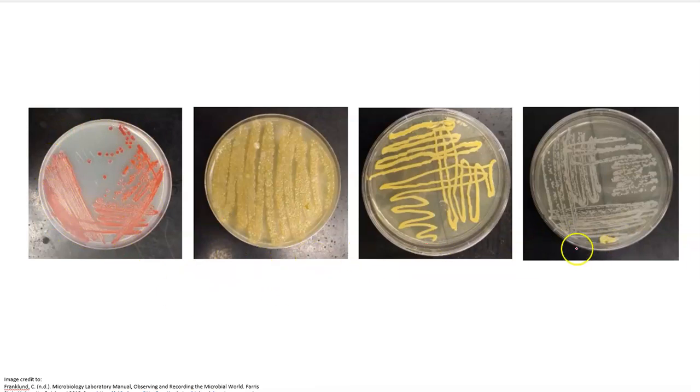These ones here are plates where the technique went wrong. So to kind of look at these, in this one, it looks like a streak plate technique wasn't even performed. It looks like whoever inoculated this one just took their bacterial sample and zigzagged it across the entire plate. So really failed to separate it into those 4 separate quadrants. And we also see that there's this colony here that looks different from all this other yellow growth. So this is likely contamination here.